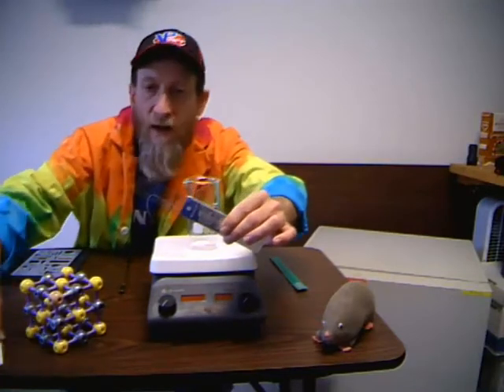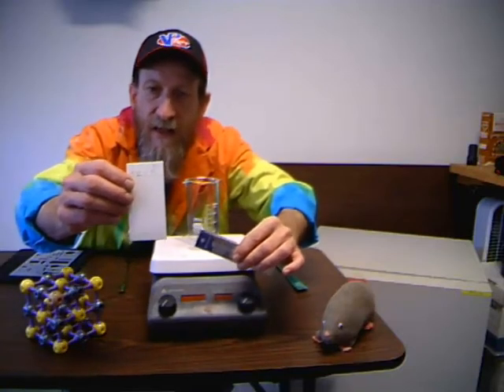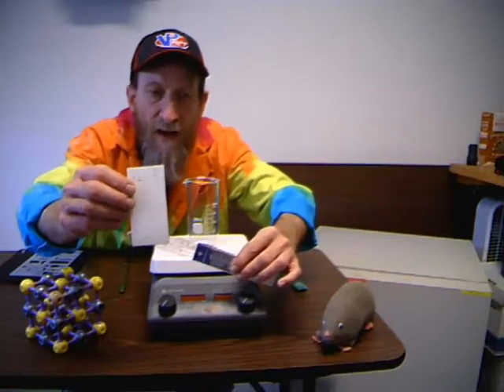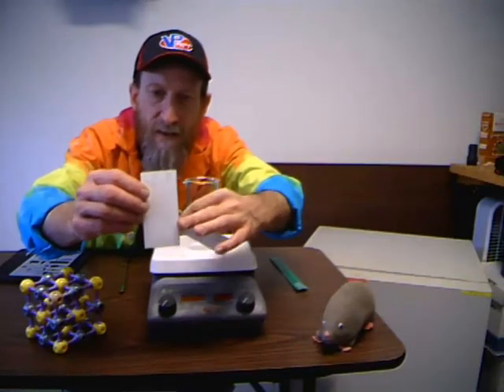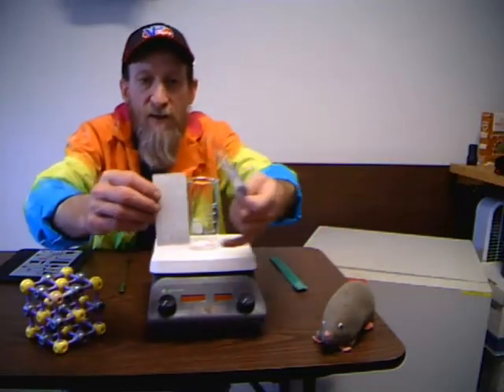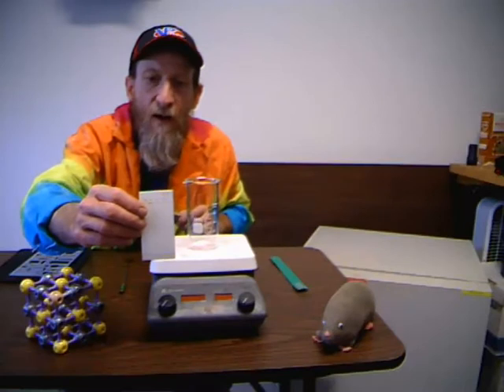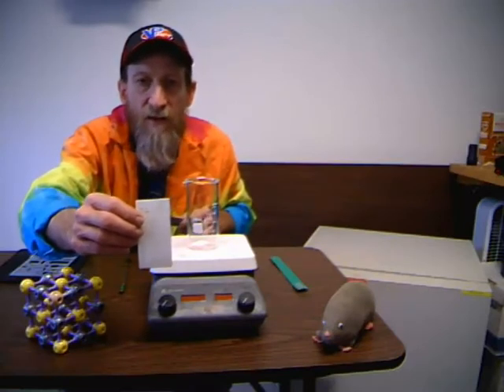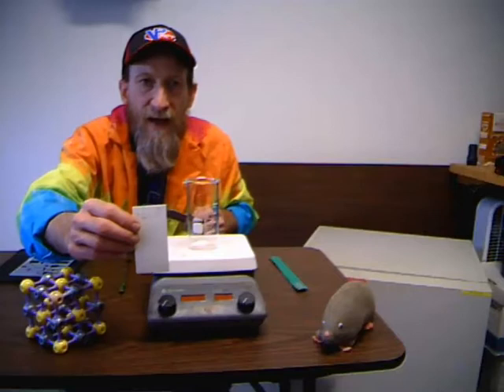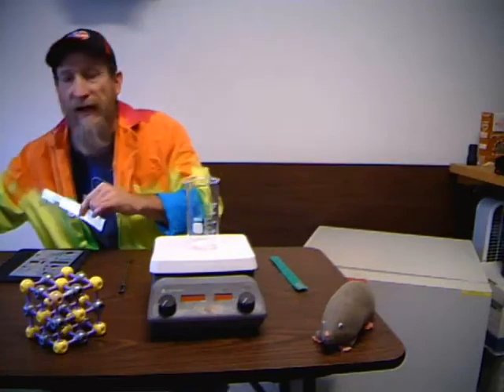A ruler is especially useful when you are doing thin layer chromatography, which is often called TLC. With TLC, you have plates coated with an adsorbent material. You spot it, put it into a solvent, it wicks up the plate taking some of the solute along with it, or it separates different impurities out of your mixture, and then you analyze it. One way you do that is you measure the distance the solvent moved and the distance the spot moved, which gives you something called the RF value. So a good ruler is very important.